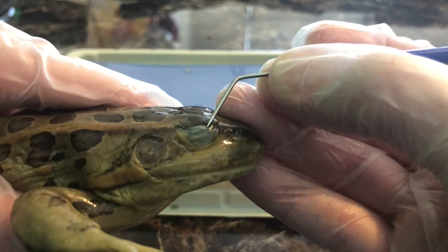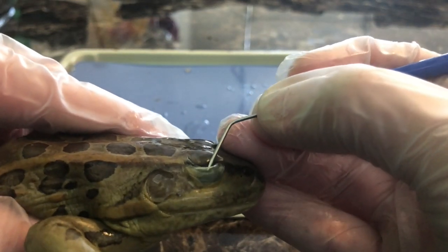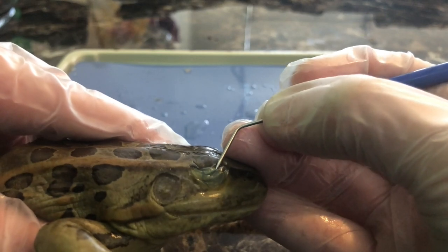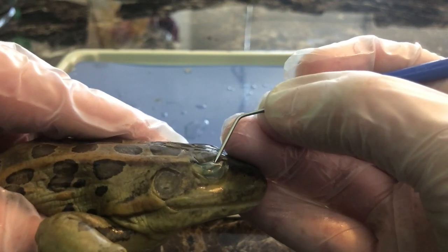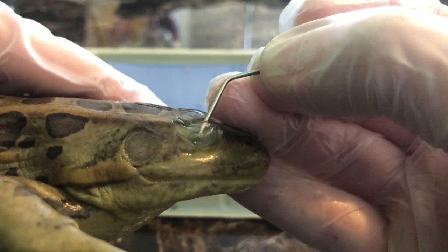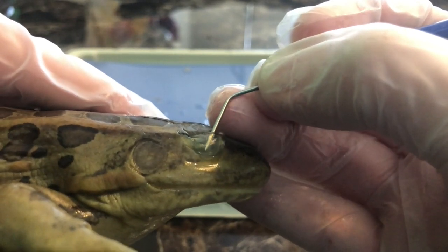Now we're going to focus on the frog's eyes. Frogs have a total of three eyelids: one coming down, one coming up, and then a third eyelid called the nictitating membrane. The nictitating membrane is a translucent eyelid that covers the actual eye, so the frog can still see underwater and it helps protect the eye from debris or anything in the water that may scratch or damage it. You can see I'm putting the probe between the eye and the nictitating membrane.